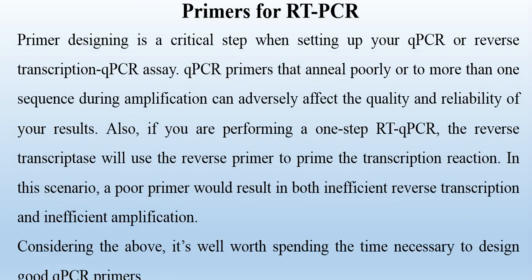In this video, we will discuss how to design the primer for RT-PCR. But you must know that primer designing is a critical step when setting up your qPCR or reverse transcription qPCR assay. qPCR primers that anneal poorly or to more than one sequence during amplification can adversely affect the quality and reliability of your results. Also, if you are performing a one-step RT-qPCR, the reverse transcriptase will also use the reverse primer to prime the transcription reaction. In this scenario, a poor primer would result in both inefficient reverse transcription and inefficient amplification. So, considering the above discussion, it is well worth spending the time necessary to design good quality qPCR primers.